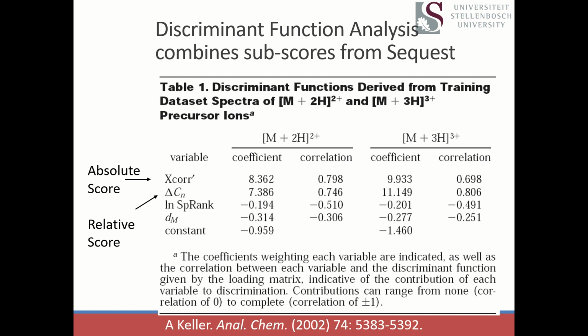All right, so the delta mass function is really, really valuable. In the case of accurate mass measurement of peptides in particular, things like Fourier transform or TOF instruments, you can trust a peptide sequence that's very, very close to what was observed more than you can trust one that's way out at the limit of what the precursor mass filter would allow for. And so this delta mass term, DM, ends up becoming quite important in how we discriminate these things.